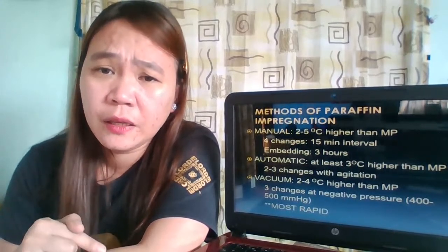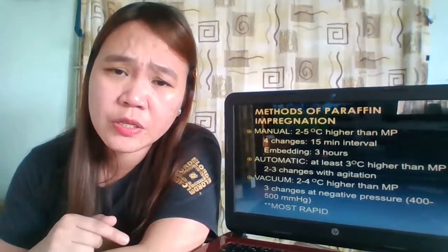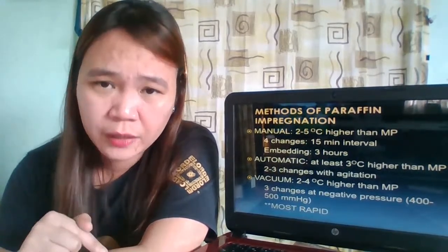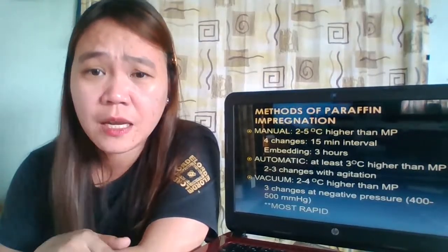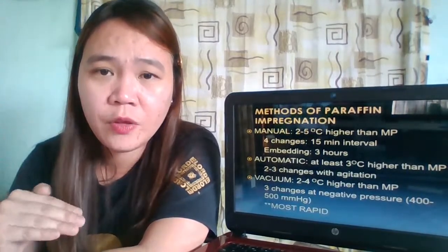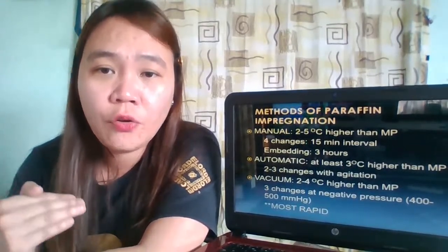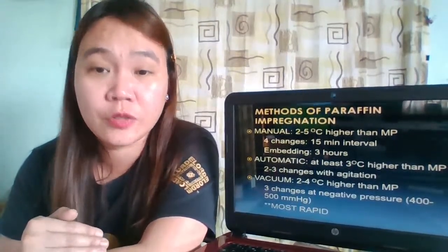In itself, paraffin is actually not damaging to your tissue sample, but because you need heat in order to maintain the liquid nature of your paraffin, that is the one that is damaging to your tissue sample. It's the heat that is involved in the impregnation process. So if you reduce the time, you reduce the exposure of your tissue sample to heat, thereby no brittleness, no shrinkage, and no hardness in your tissue sample.